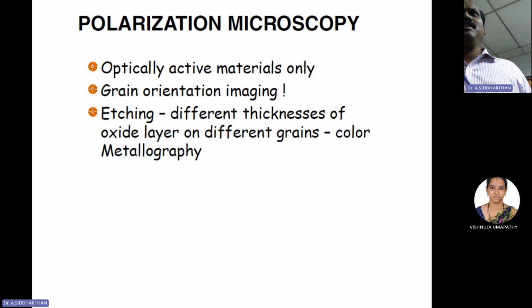we'll discuss in the next slide. Okay, next class we'll see about that. So this is the one variant. The other variant we have is the differential interference contrast microscope. With that, the special types of microscopes will be over.